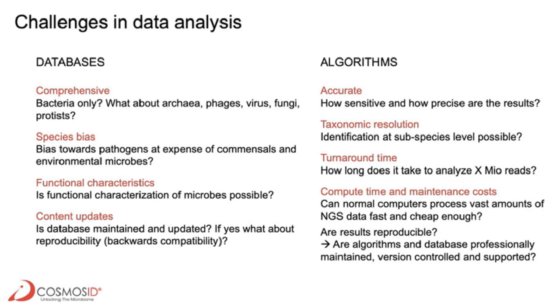The most critical factor in microbiome analysis is the database, as your analysis is only as good as the database you use. Unfortunately, most of the tools use only a bacterial database, but it is absolutely critical that the database represents all kingdoms, not bacteria only.